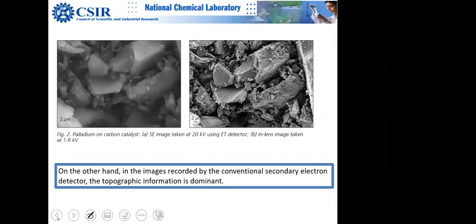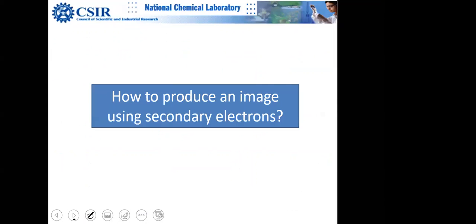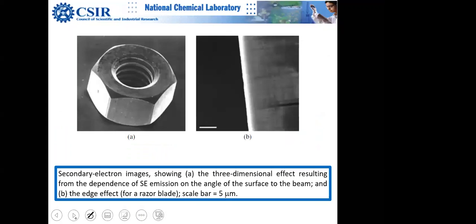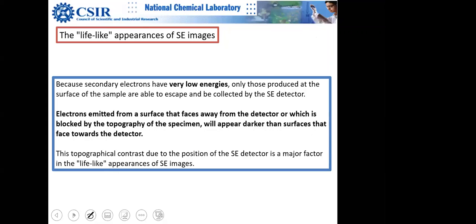So you can see there are some of the SEM images. If you are curious how SEM images look, you can immediately distinguish that they are more lifelike actually, right? It looks very lifelike, like actual life. Let me just show you some images. You can see this. This is an SEM image. These are all SEM images.